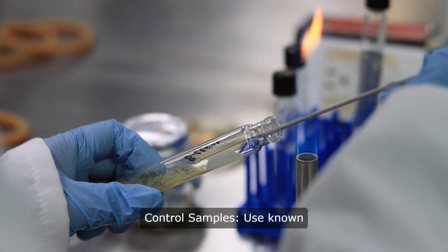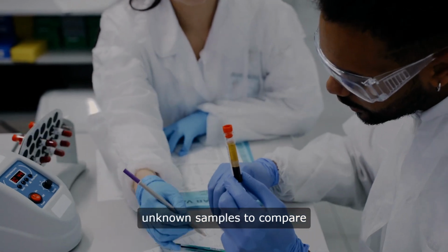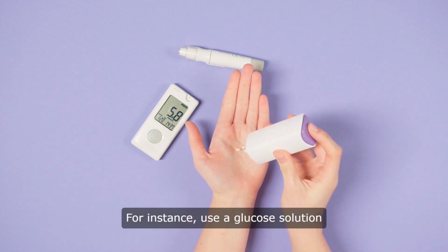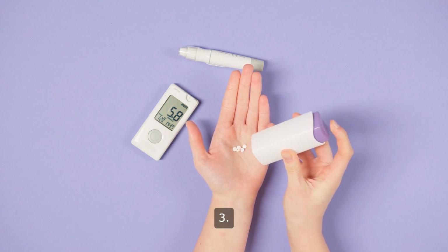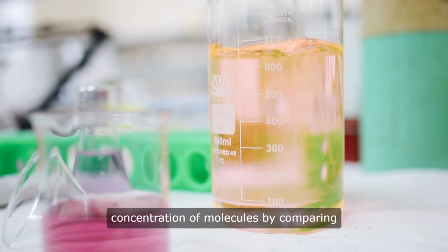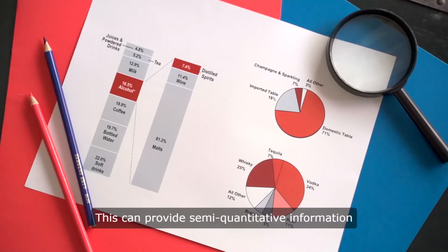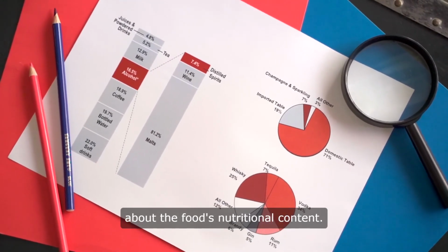2. Control samples. Use known control samples alongside unknown samples to compare results and ensure accuracy. For instance, use a glucose solution to validate the Benedict's test. 3. Quantitative analysis. Estimate the concentration of molecules by comparing the color intensity or the amount of precipitate formed. This can provide semi-quantitative information about the food's nutritional content.